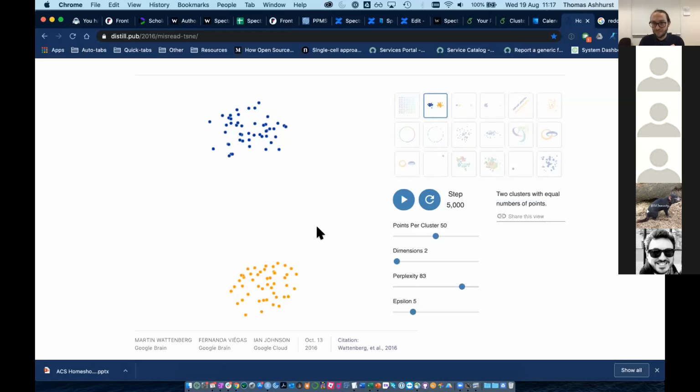You will find though, if you ran t-SNE on, let's say, 4 or 5 cellular markers, then a perplexity of 30 will go to too much granularity and you'll get these groups of cells splitting off randomly. That's just driven by noise effectively. So you do see some factors like that. One of the best options is to run multiple iterations and see how that matches what you understand of that cellular system. But I mean, just start at 30. There's not a good reason to start with something different. That's probably a general rule for most things. Just start with the default because you've got to start somewhere. But you can run a couple of them with different settings and see how it looks.